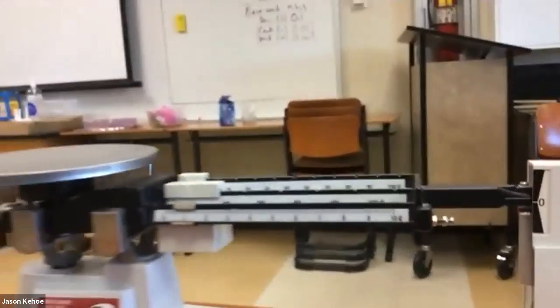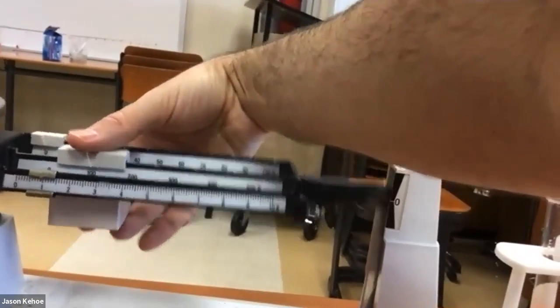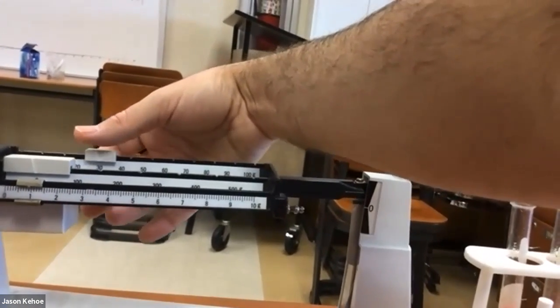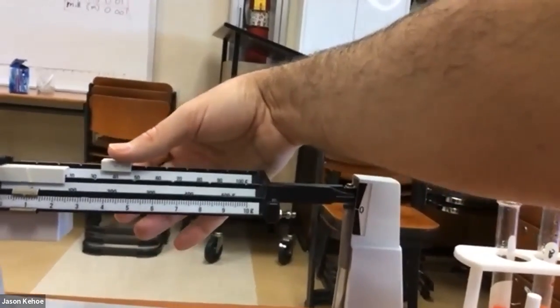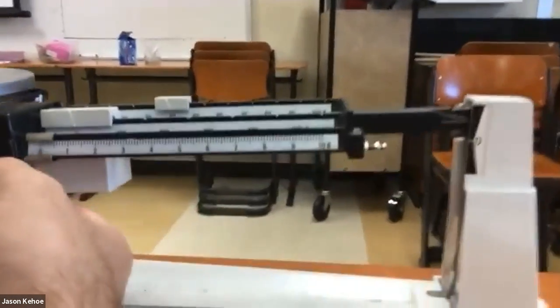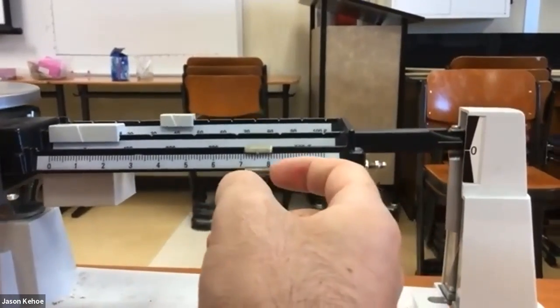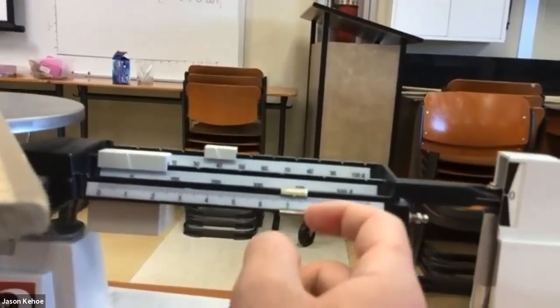Now it says ruler. I'm using a 1/2 meter stick, but that'll do. Less than 100 grams. Less than 50, but more than 40. Oh, this wasn't quite set to 0. There we go.